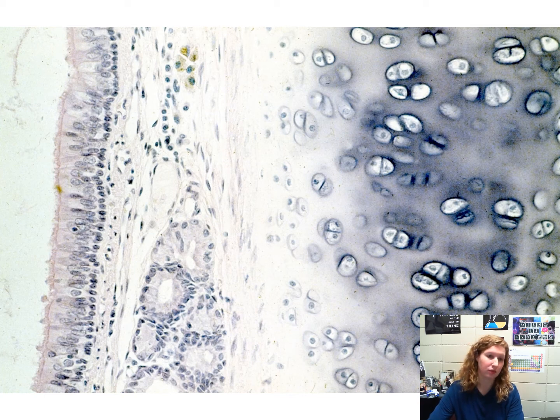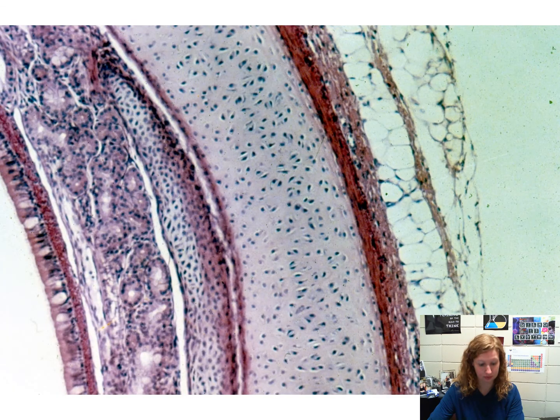You've got some pseudostratified ciliated columnar epithelium and looks like some smooth muscle as well. So mostly we're looking at cartilage here on the right side. Also looking in the middle at just a general layer of cartilage.